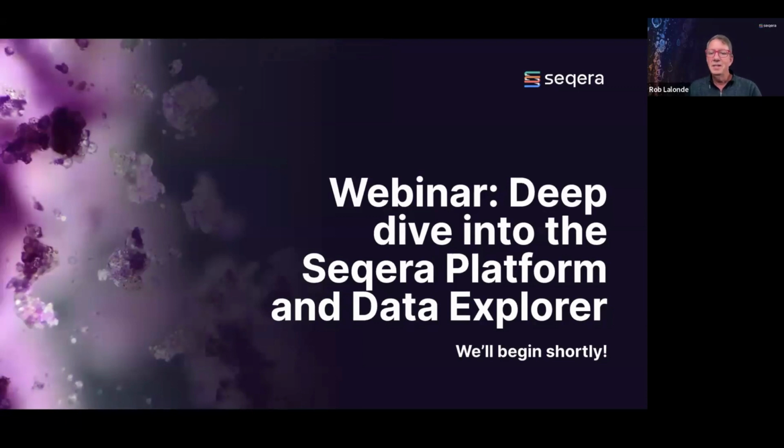We're going to take a deep dive into the Seqera platform and one of its capabilities, specifically Data Explorer, and Aisha is going to lead the show on that front.